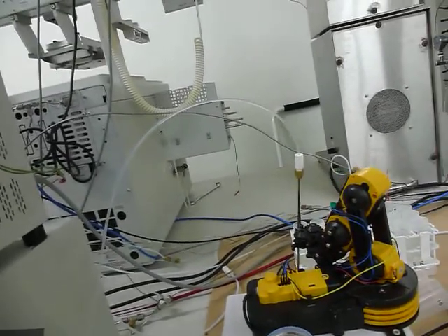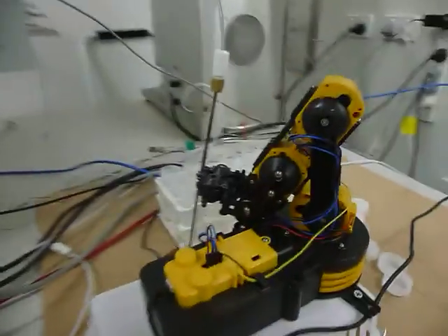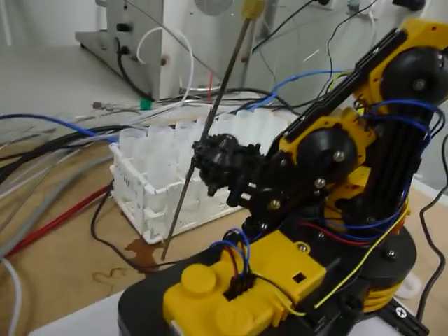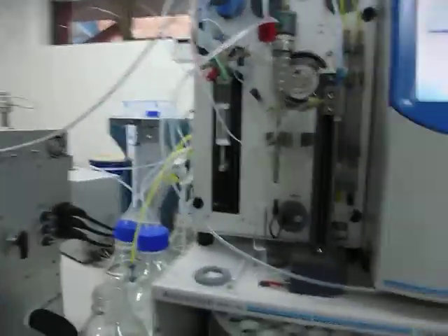I also glued this stainless steel line here, more or less a straight line. There is a connection here between the stainless steel line and a 1/8 inch Teflon tube that goes to the IRMS.